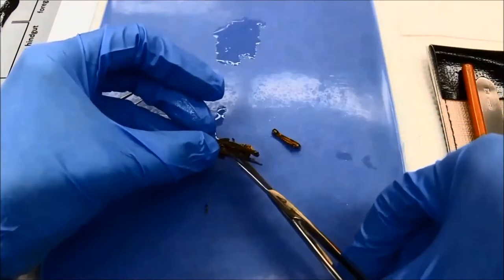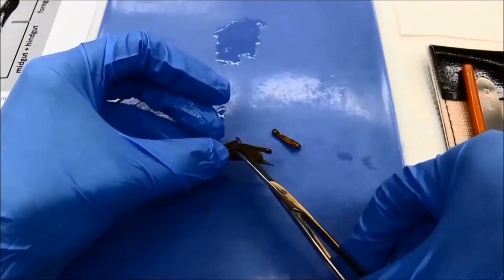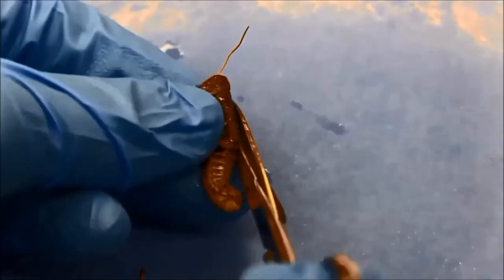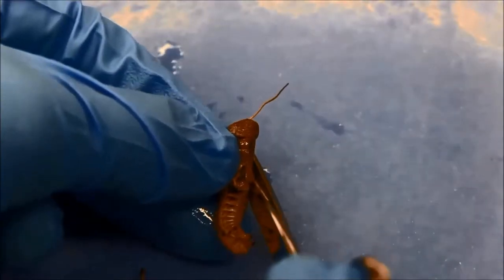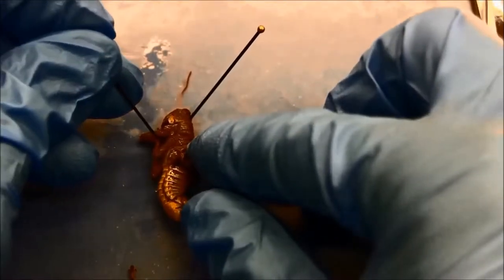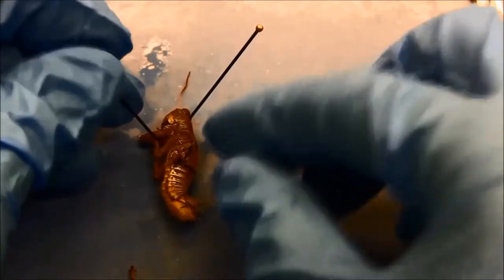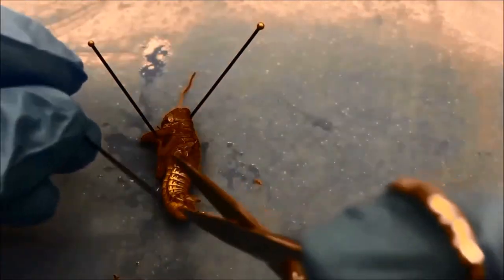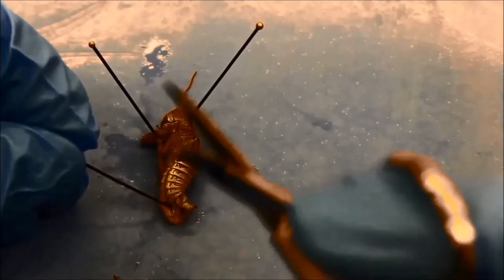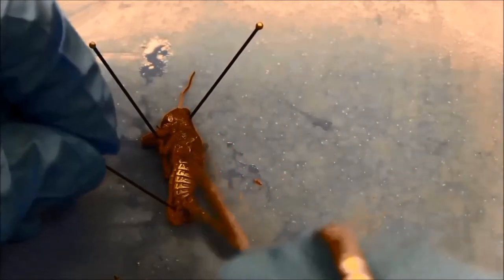Then, using scissors, I carefully remove the hind legs and the wings. After this, I put the grasshopper on its side and use insect pins to anchor it to the dissecting pad.